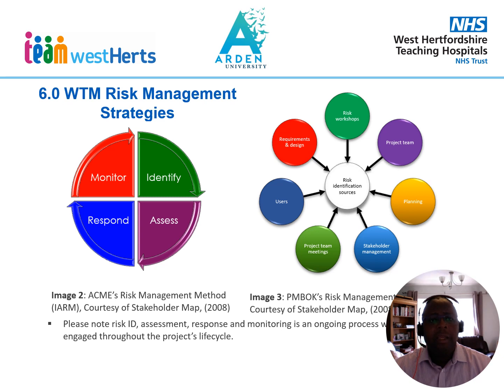I've shown an image there where risk identification is an ongoing process throughout a project's life cycle. I've shown that through interaction with risk workshops, risk requirements and design, users, project management meetings, and stakeholder meetings, we will be able to continually identify, monitor and respond to risks associated with this electronic temperature monitoring project.